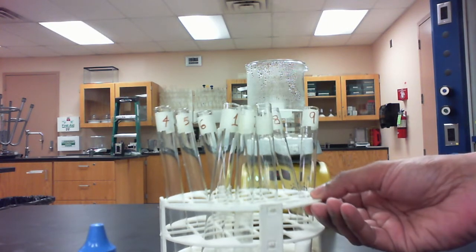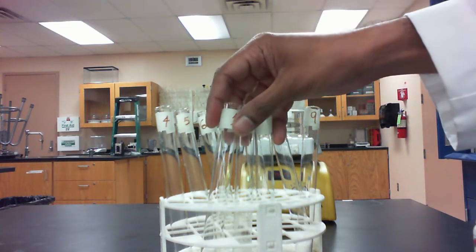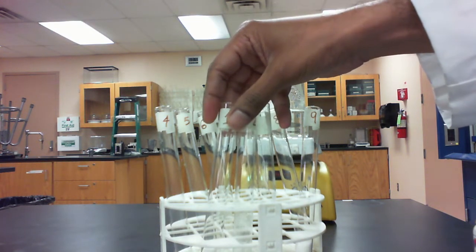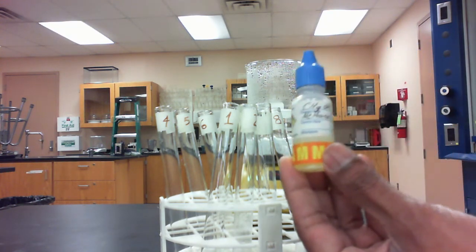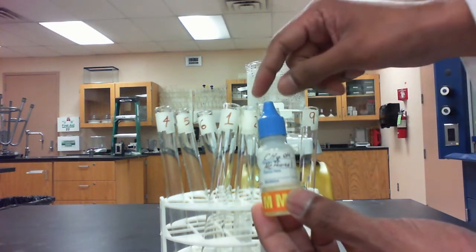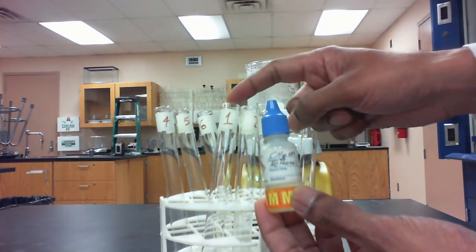So in this step, we're going to be adding the corresponding alcohol to the tubes. In test tubes 1, 2, and 3, you'll notice now that all of these have a liquid in them. I've added to each of them 1 milliliter of a first alcohol, which is methanol. I've added approximately 20 drops, which is about equal to 1 ml, to test tubes 1, 2, and 3.